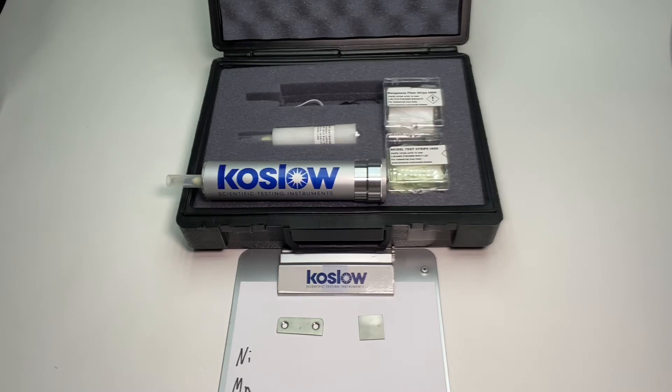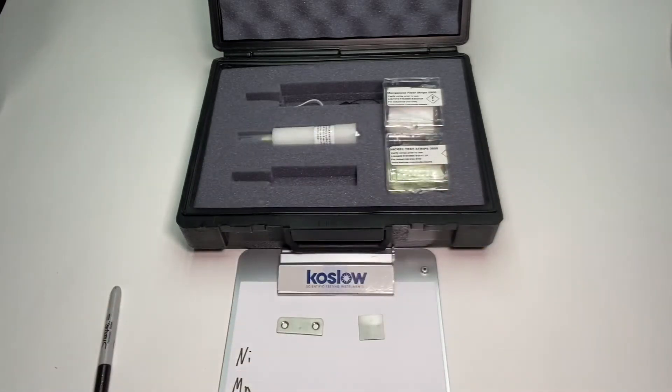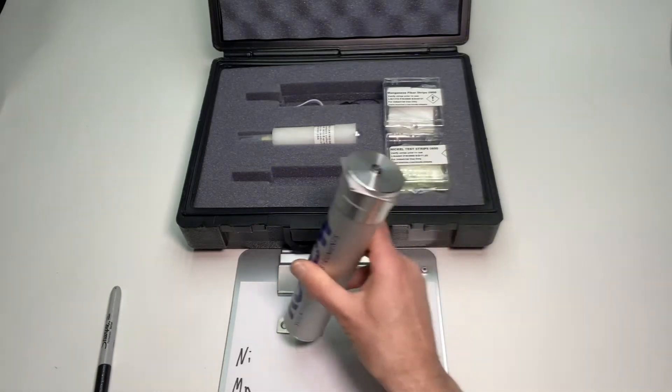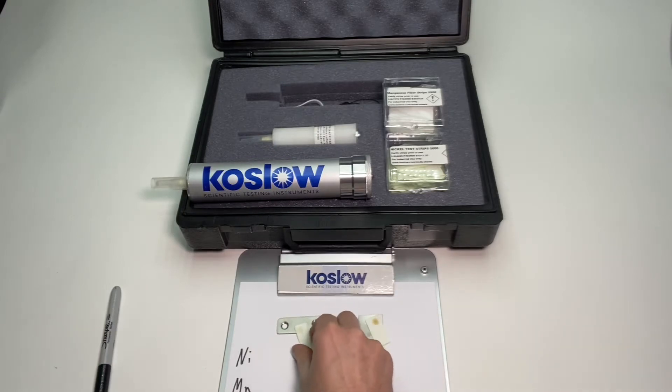To sort between the 200 series versus the 300 series, first I'm going to do the nickel test. I take a piece of nickel paper which is included in the kit, about one second per piece.